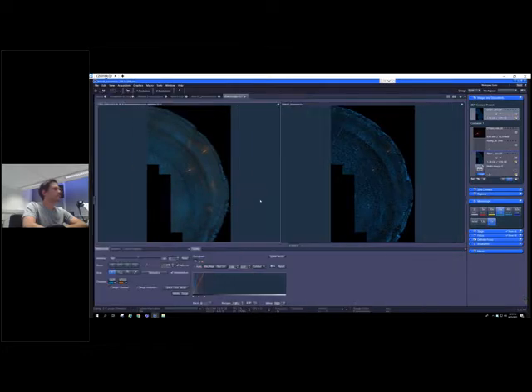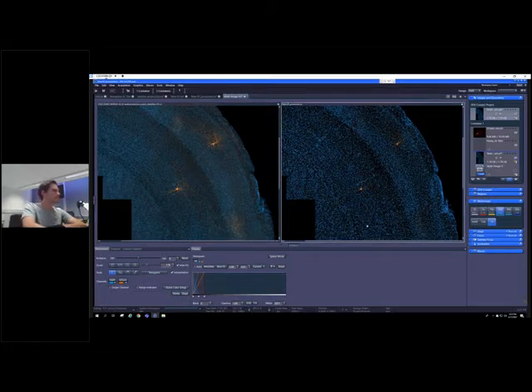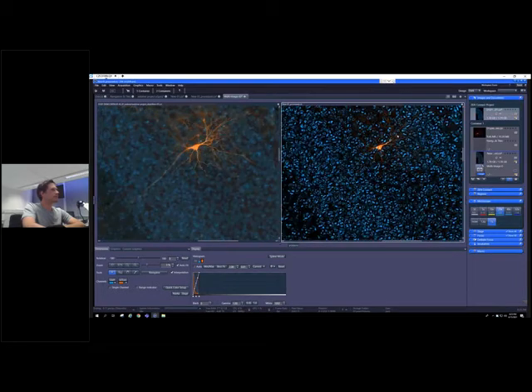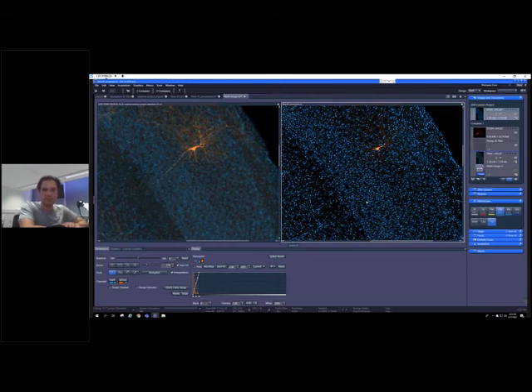All right, so here we go and have on the one hand side our perfectly focused single plane tile scan. And on the other side, you can see that we directly get our online processed images, our cleaned up images using the deblurring functionality to get rid of some of the out of focus blur of the images.